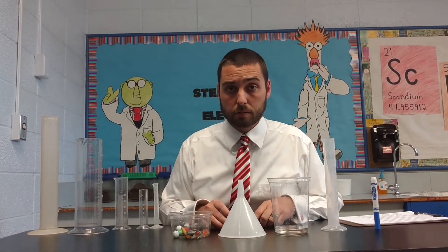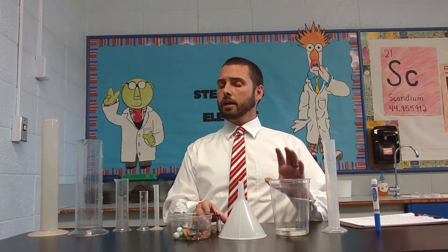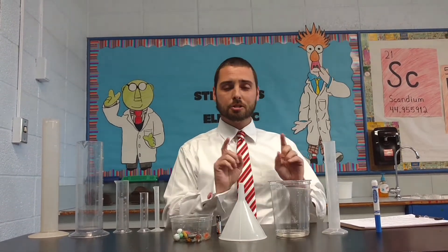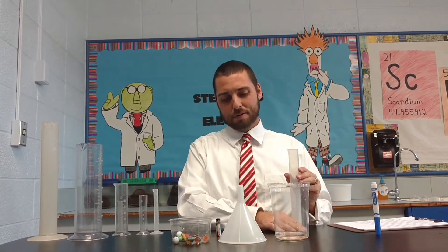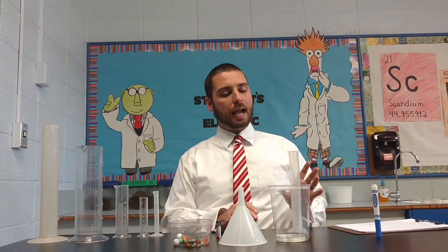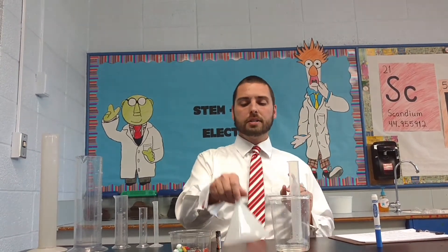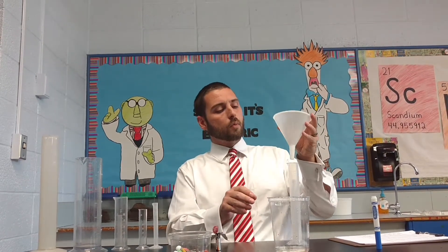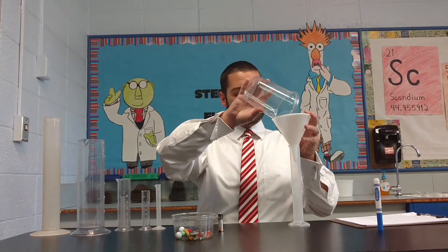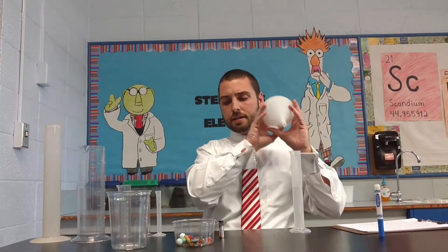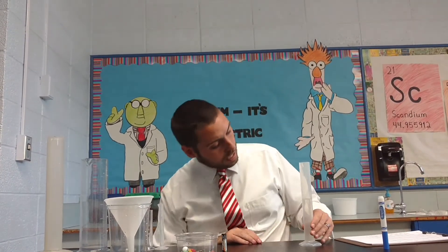Well, how do we then find the volume? Worry not, children — I will tell you how. We use this handy dandy graduated cylinder. You may be wondering how we use that graduated cylinder. I'm going to model for you. We take our funnel, we take our water, and we pour it in there. I'm going to set that off to the side and we'll come back to it later.